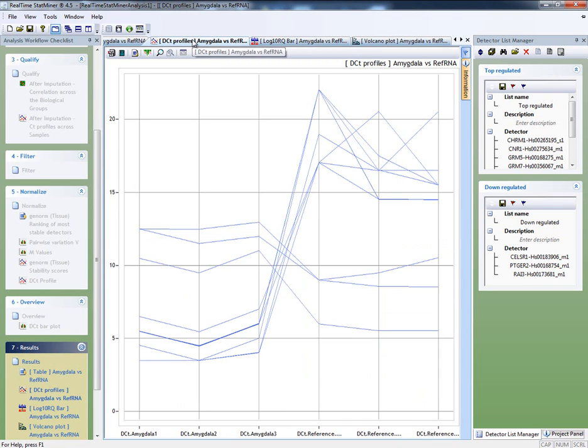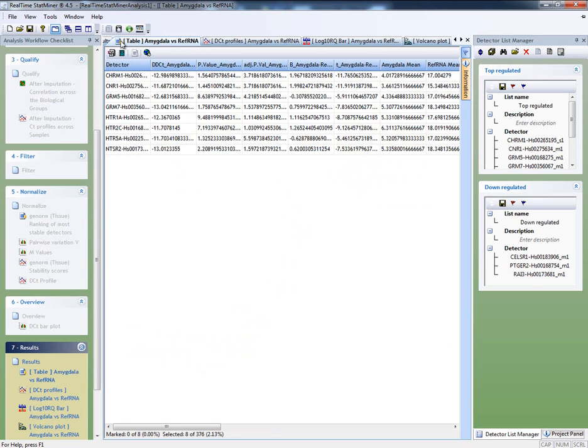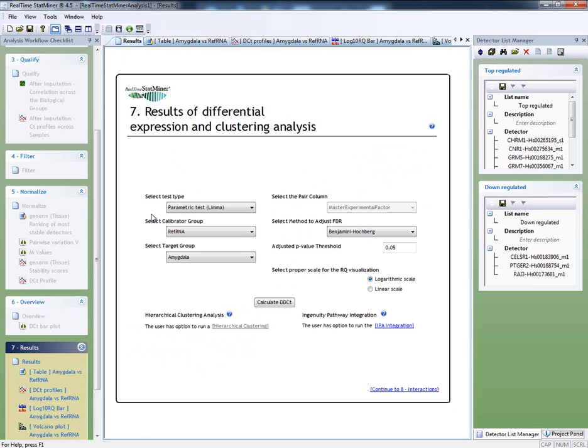Now that the profile has been properly filtered, it is easy to identify and validate expression results. These are the top regulated detectors, and as expected, delta CT values present a very low variability within these groups. Statistical test rejects high variabilities. And there is a large difference between the means of the groups. Let us go back to the all versus control report to check what happens with our detectors of interest when compared with the rest of the groups.